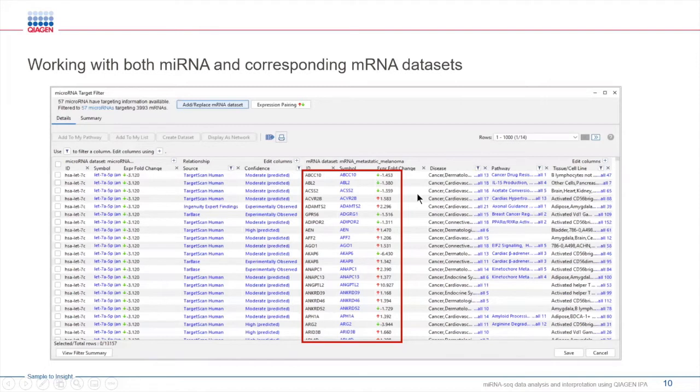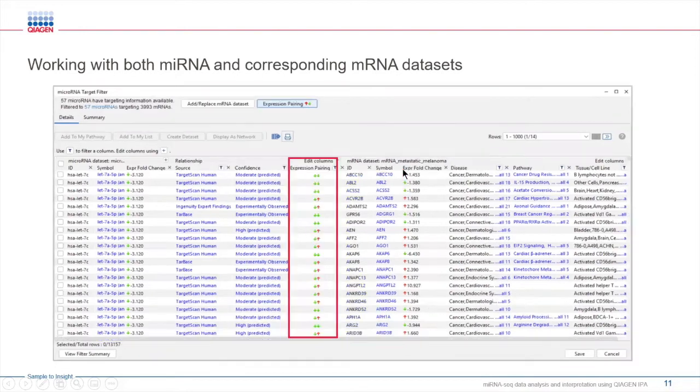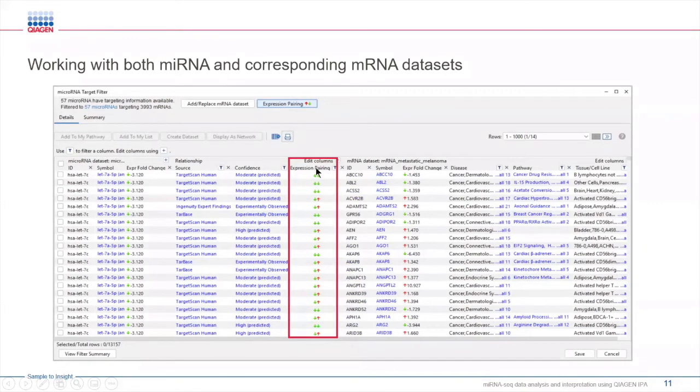When you have experimental expression values, such as fold change that you see here, users like you often ask, how can I narrow down my list of targets using expression patterns coming from my data? In IPA, you can easily do this by clicking here. With this feature, you can prioritize mRNA targets based on the change of expression observed in your data.